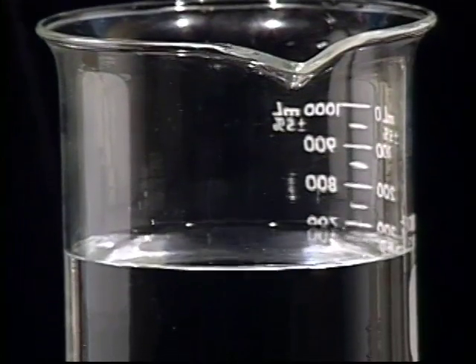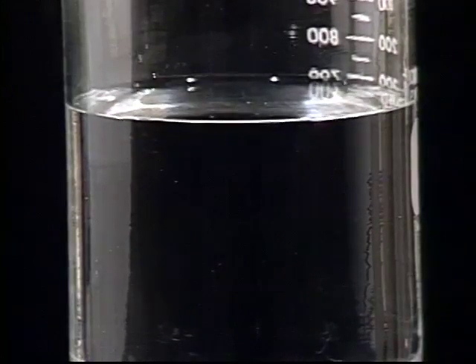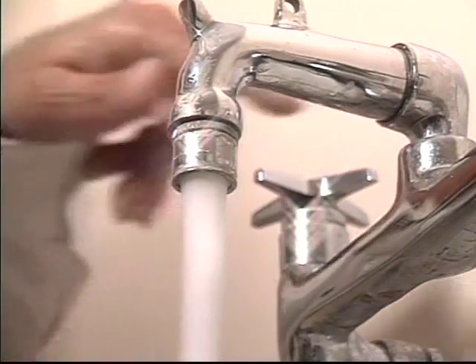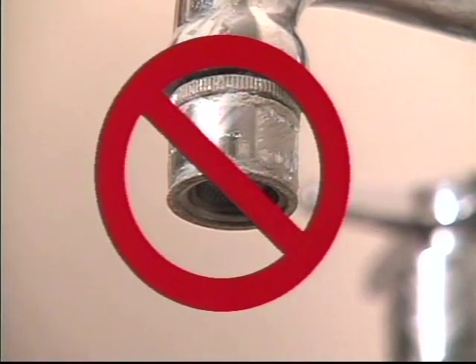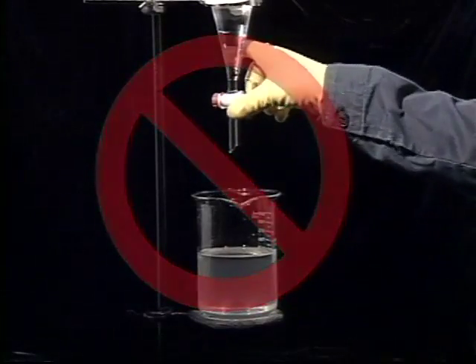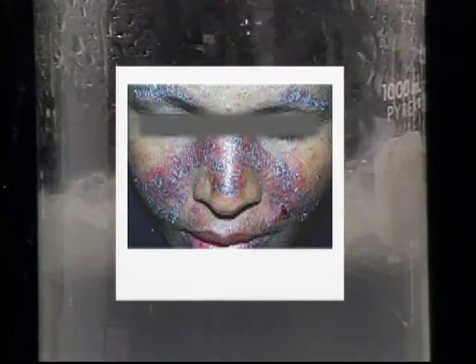Together, acid's reactive and corrosive nature create a special hazard when acid is being diluted. In daily life, it comes naturally to add water to dilute a substance. But never add water to sulfuric acid. The first drops of water entering the acid will be attacked so ferociously they will boil, spattering undiluted acid out of the vessel.